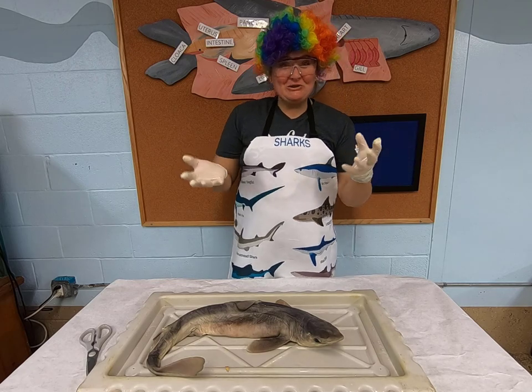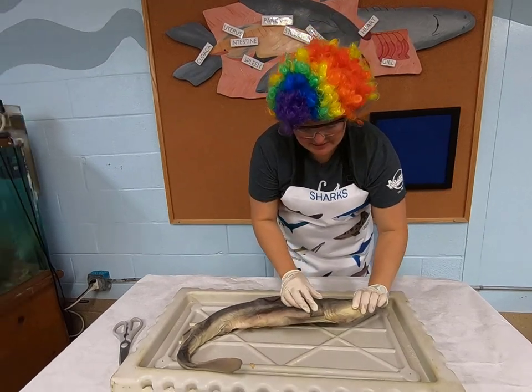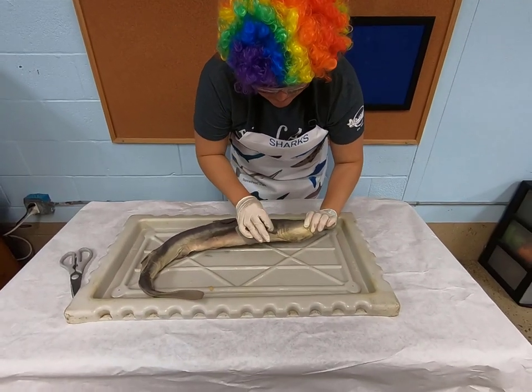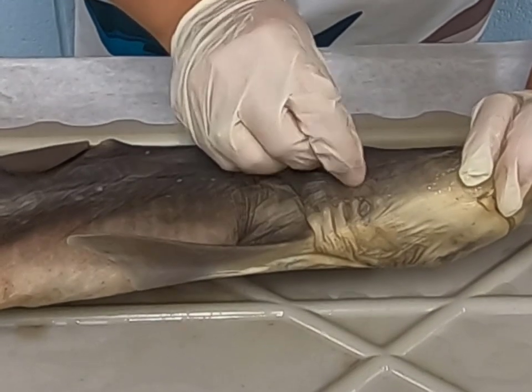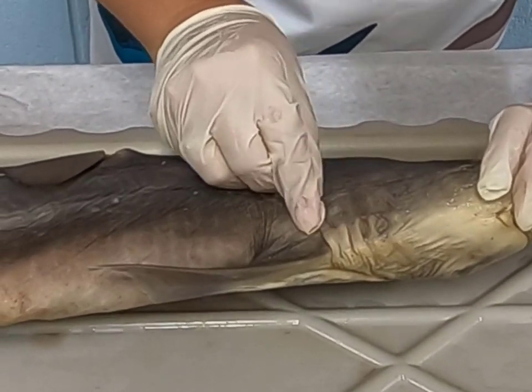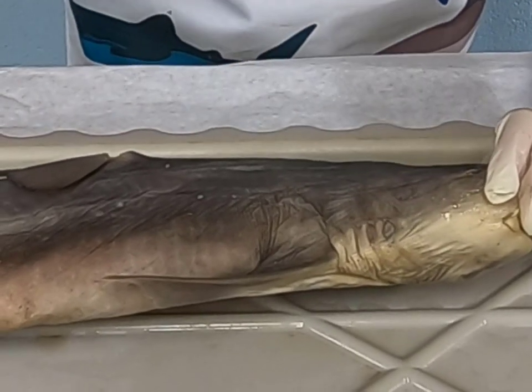So sharks do breathe water. Sharks will have between 5 and 7 gill slits. So you can count the gill slits. We have 1, 2, 3, 4, 5 gill slits. So we have 5 gill slits right here. And those gills allow them to breathe underwater.